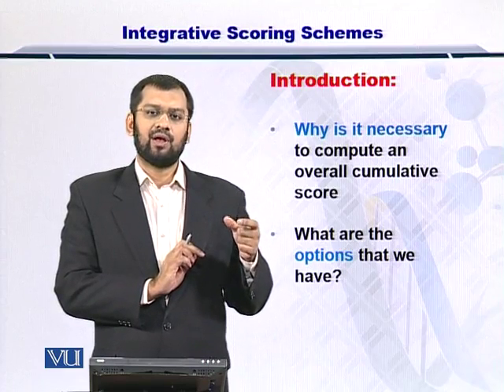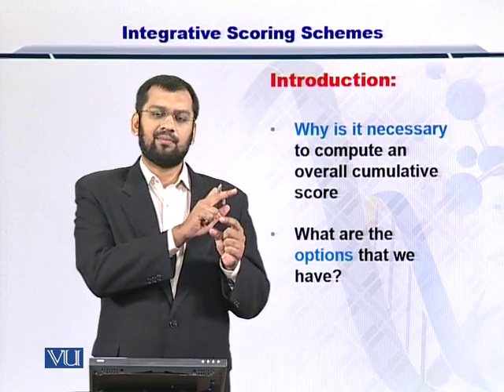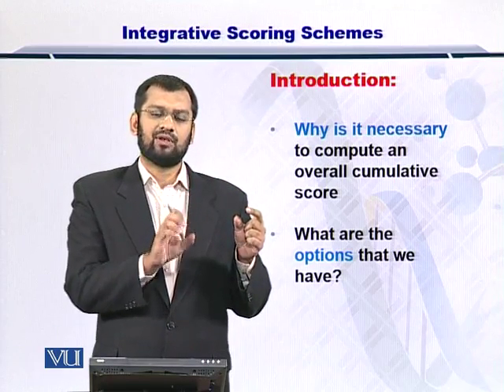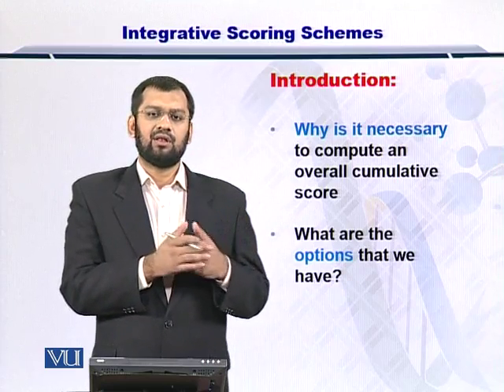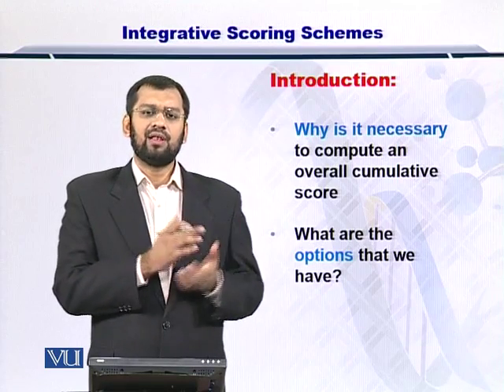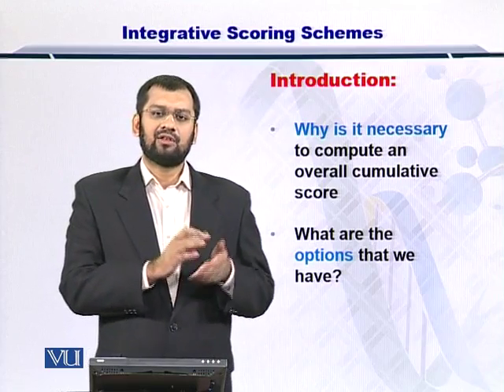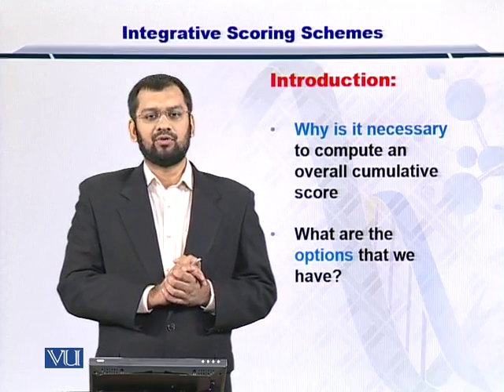The score from the molecular weight will just tell you how close the experimental MS1 is to the candidate protein's mass from the database. So this can be a number ranging between a very small decimal fraction or a very large number.